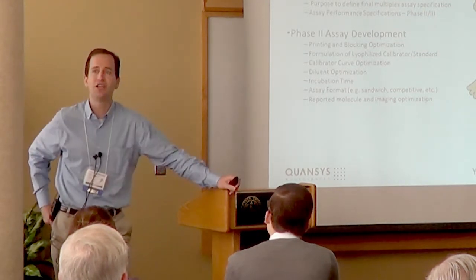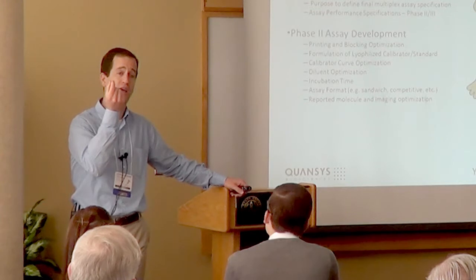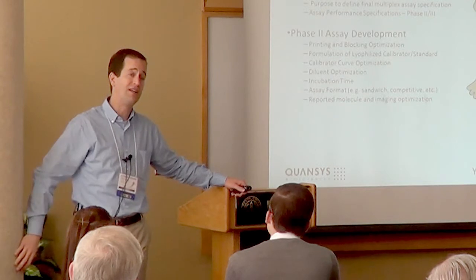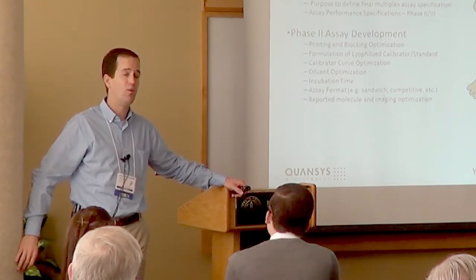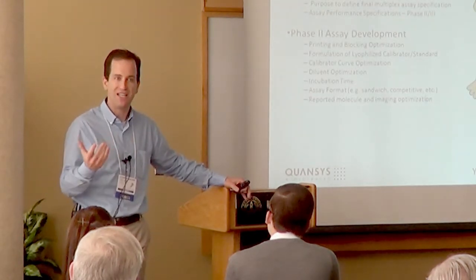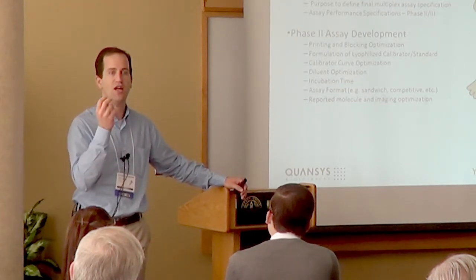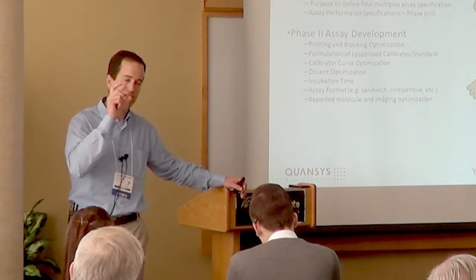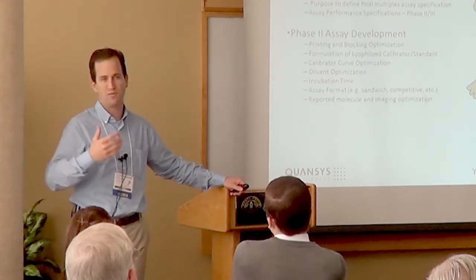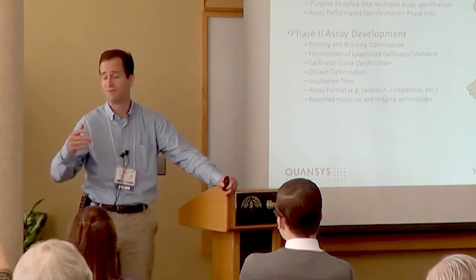Typically, in the industry, when people do that, they will use recombinant antibodies that they then engineer with a cysteine, so they can use a disulfide bridge and bind that down on the plate to orient the antibody in that direction. We currently don't employ that. In the literature, from what I've seen, there really isn't a significant benefit to orienting the antibodies. There is enough functional antibody bound down in all the orientations that you don't necessarily see a significant improvement in sensitivity or specificity by employing those. So, great question though, great question.